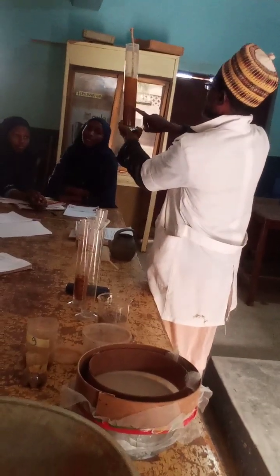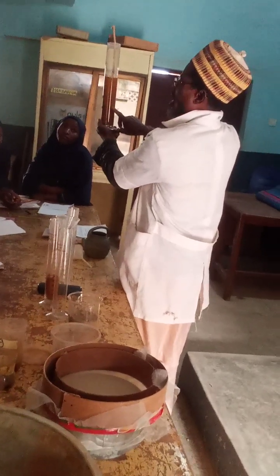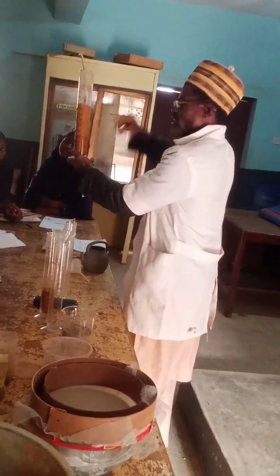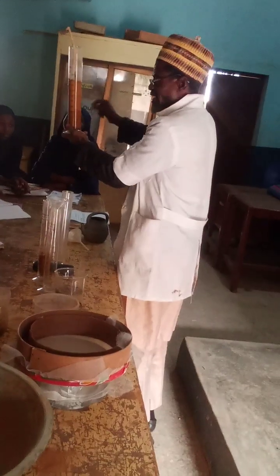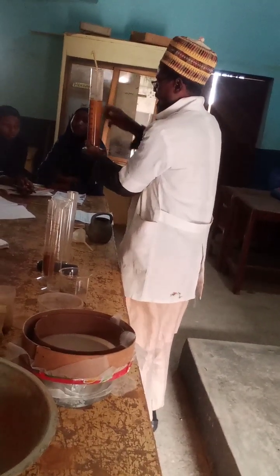That's almost 160 mil. The reason for that is for you to know how to calculate the proportion of sand, silt, and clay in the soil particles.